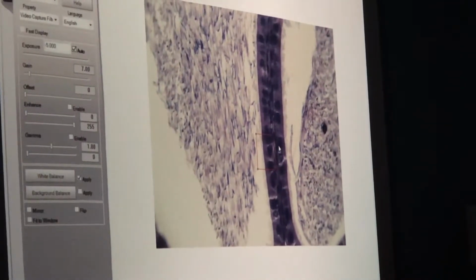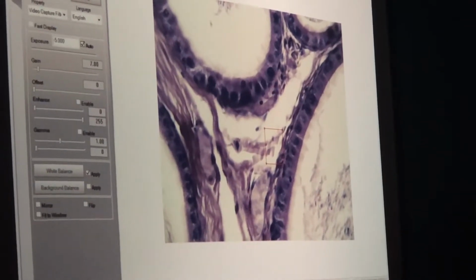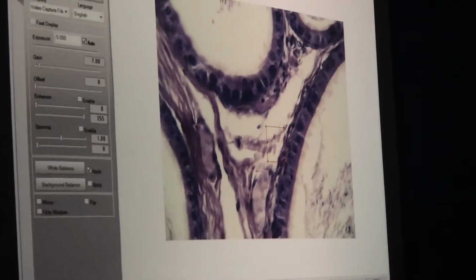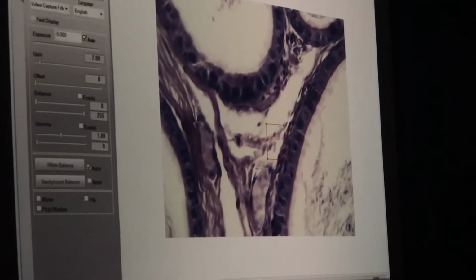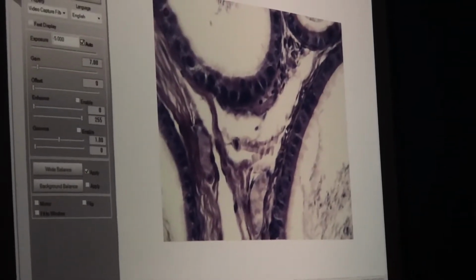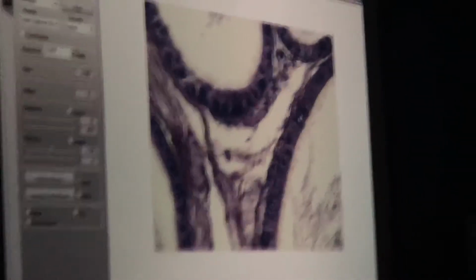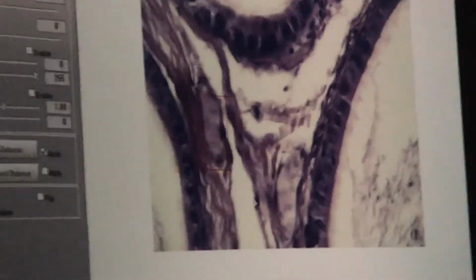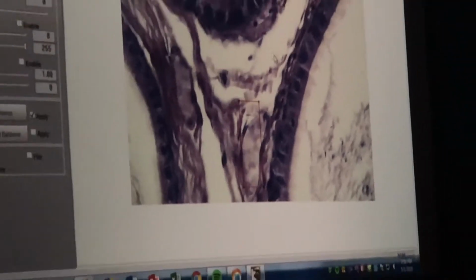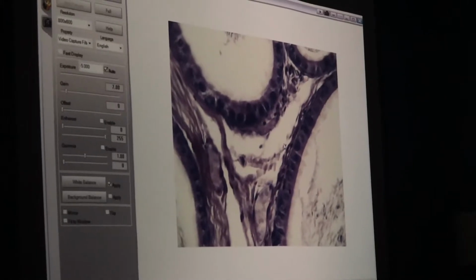In there. So you can see them kind of here. Here. Somebody's whispering it, I can tell. Starts with an S. Smooth muscle, yeah, smooth muscle. What's this? Blood vessel? Yeah, it is a blood vessel. What's this? Another blood vessel? Another blood vessel. Good. What else are we supposed to find on here? Blood, but the other vessel.